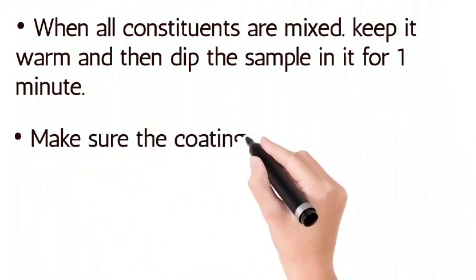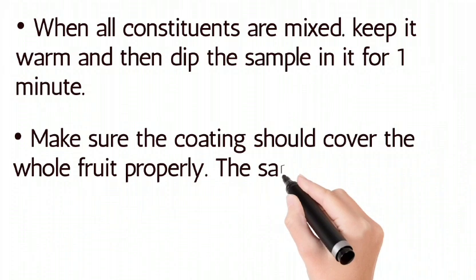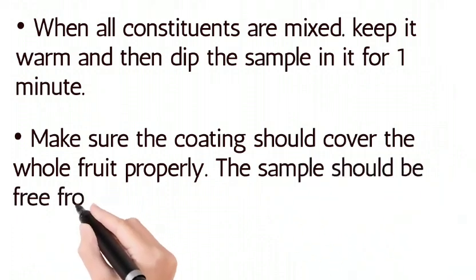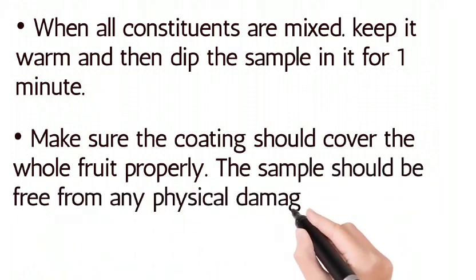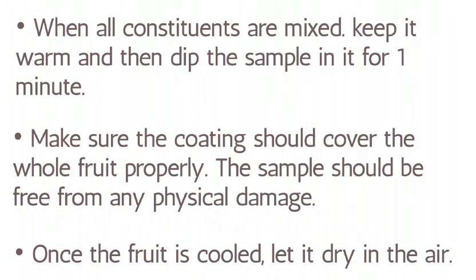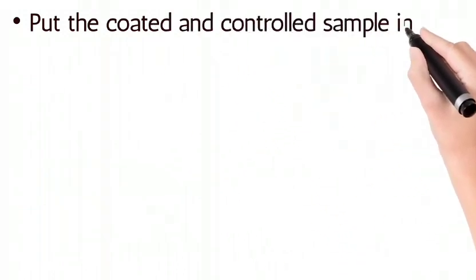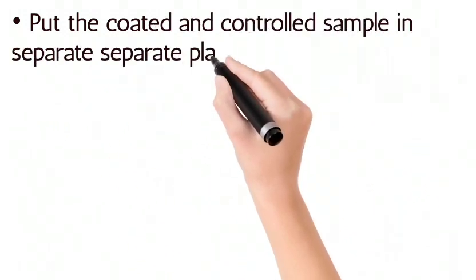Dip the sample in the coating solution for one minute. Make sure the coating covers the whole fruit properly; the sample should be free from any physical damage. Once the fruit is coated, let it dry in air.